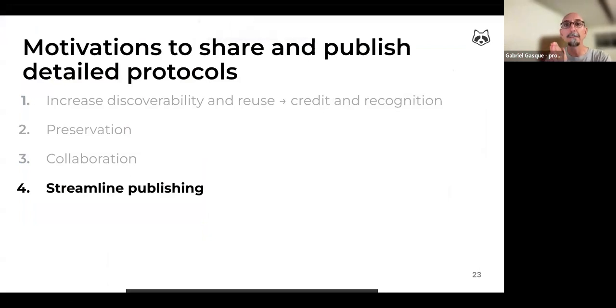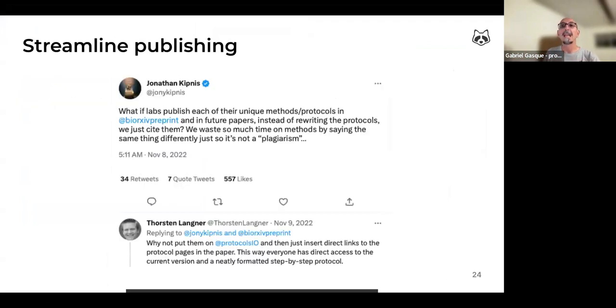And managing and publishing your protocols should also simplify your work down the road when the time of submitting and publishing a paper comes. Let me use another example from Twitter. We have here Professor Kipnis at Washington University in the US tweeting, "What if labs publish each of their unique methods or protocols, and in future papers, instead of rewriting the protocols, we just cite them? We waste so much time on methods by saying the same thing differently."